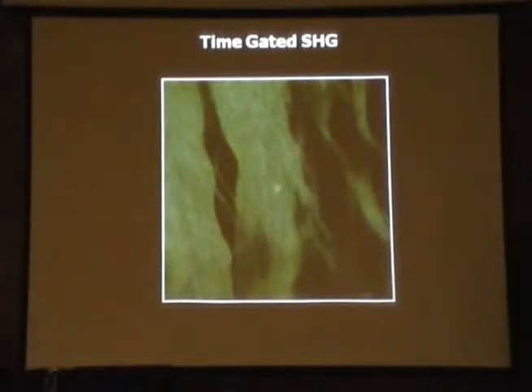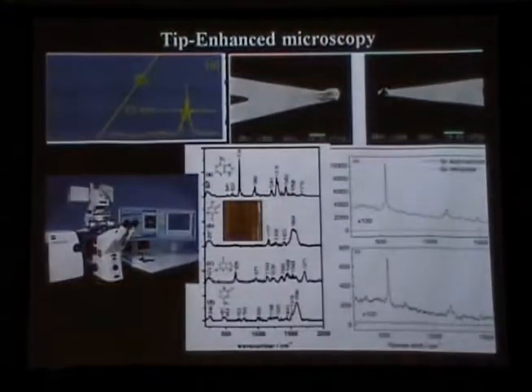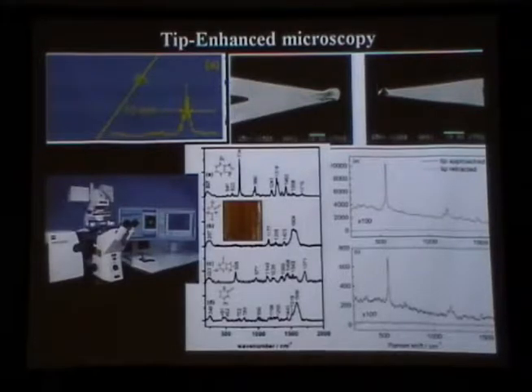If you wanted to extract second harmonic generation, which is ultrafast, so it's coherent with the laser, from fluorescence, you can use this time-gated setup. Everything is combined here, but I only see the second harmonic generation because it's fast, and the fluorescence comes later. And the last equipment is already in Brazil. It's not installed there yet.